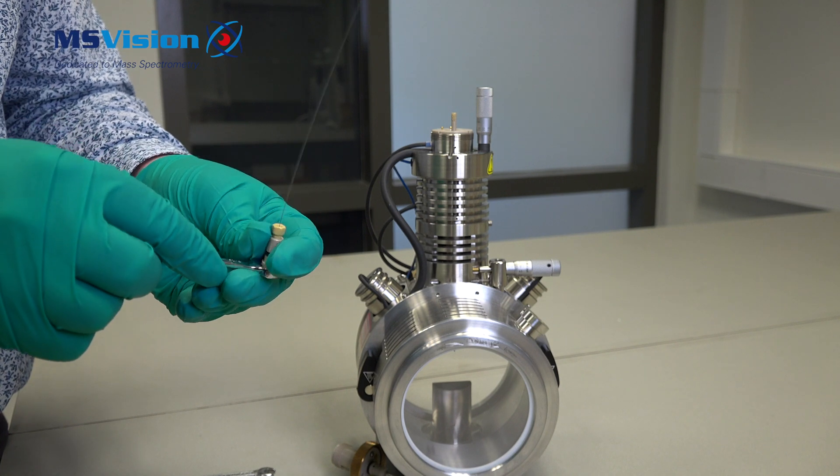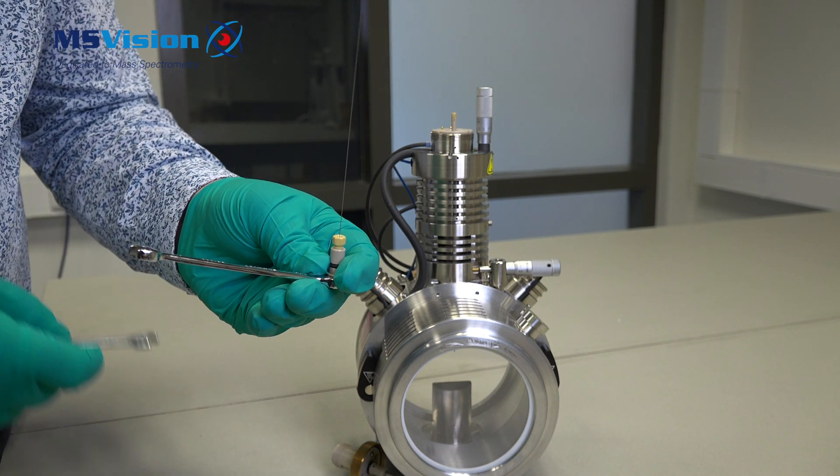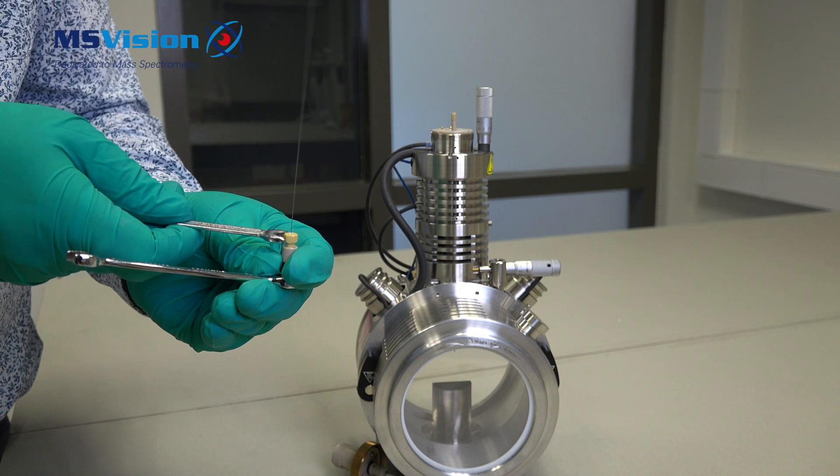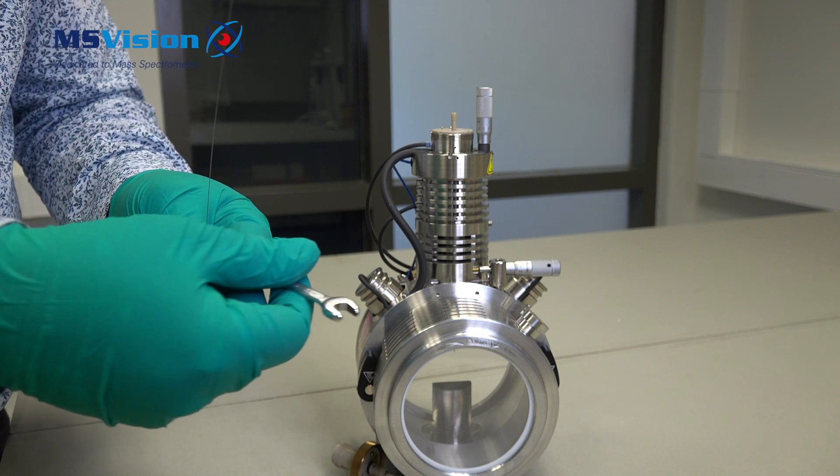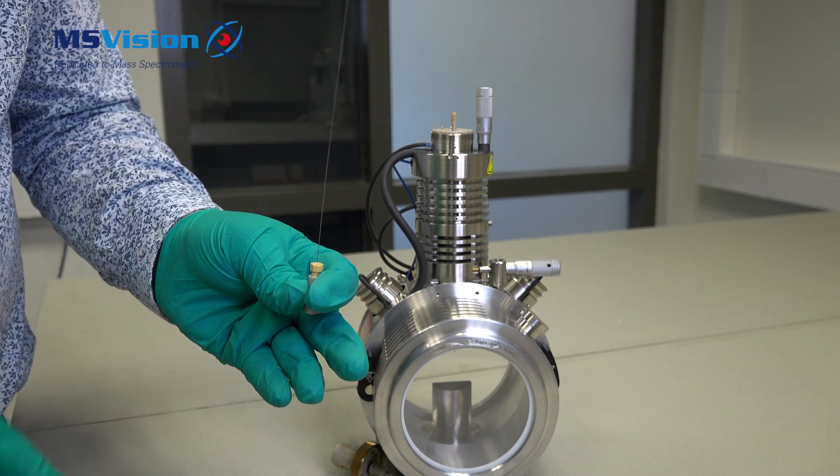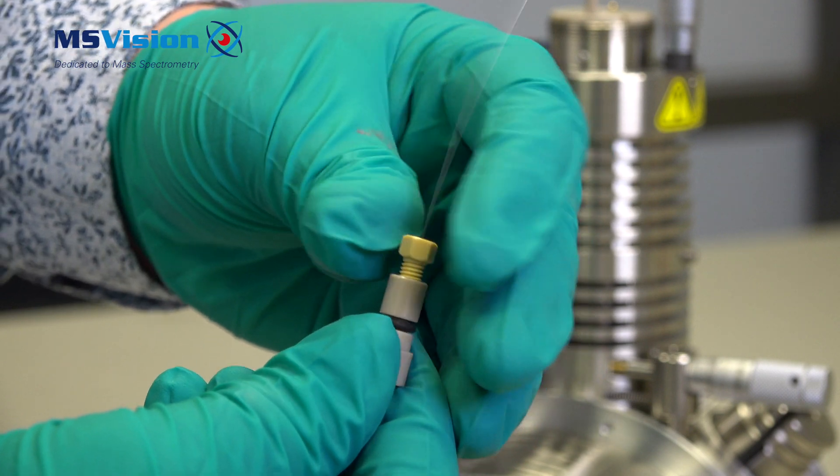Using two HPLC spanners, loosen the capillary as shown and unscrew the fitting. Remove the nut from the old capillary to use with the new one.